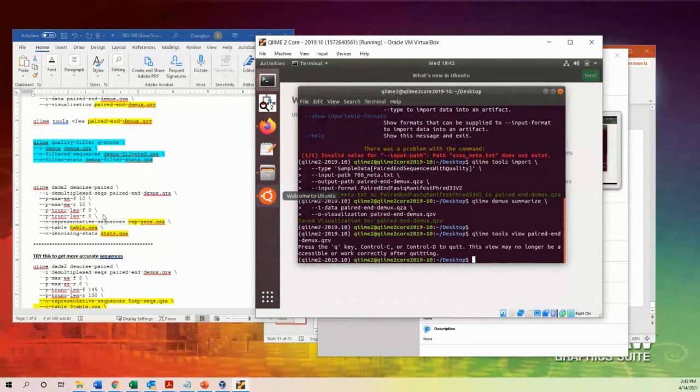Denoise. This process, on my computer, would take 2-3 hours. So I would not ask you to do this, but I already performed this, okay? So later on, I will send this sequence. These are 3 files. I will send these 3 files to the Blackboard so that you can have these 3 files. Or you can do it after class.